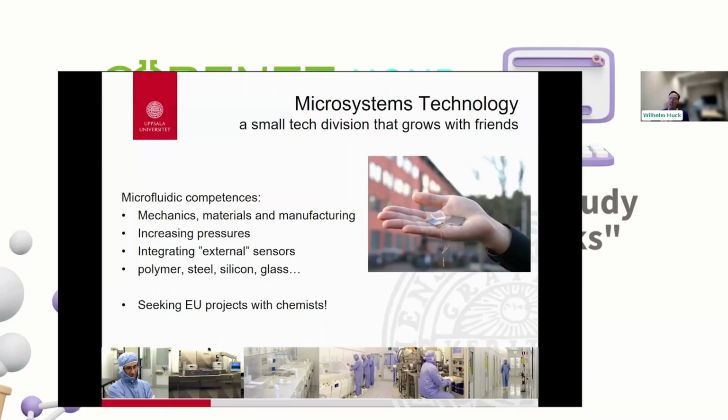But the way you could do it is, for example, you take a certain picture that has lots of different pixels, and say the pixels can be black and white. What you would do is go from the top to the bottom and then up again and down, up and down, column after column. Every time your pixel is black, you say that's a 1, and the formaldehyde input would go up. And if it goes to a white pixel, it would go down, and the formaldehyde concentration goes down again. And you work through all your pixels.